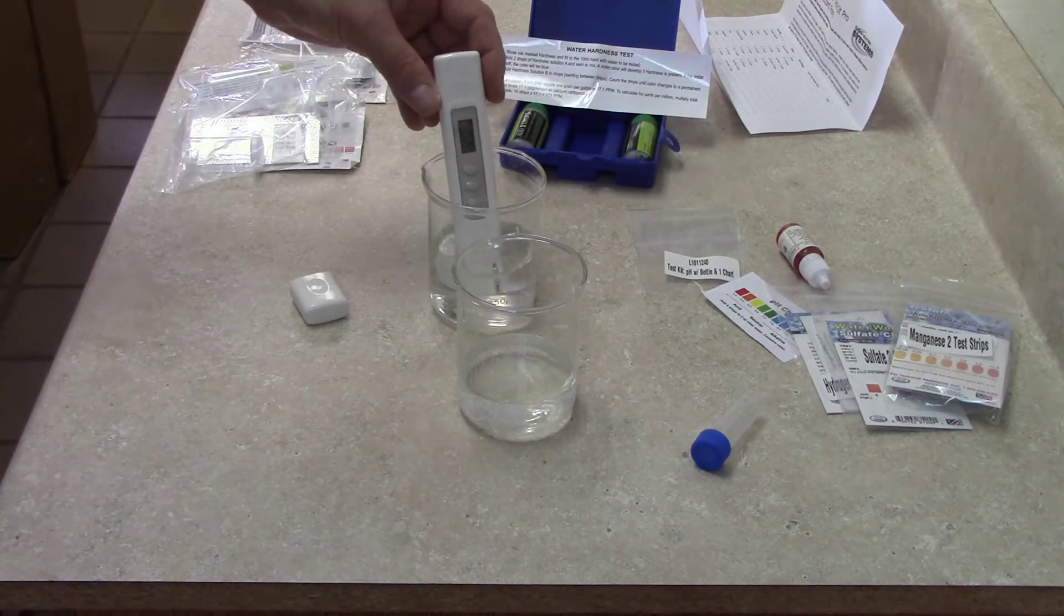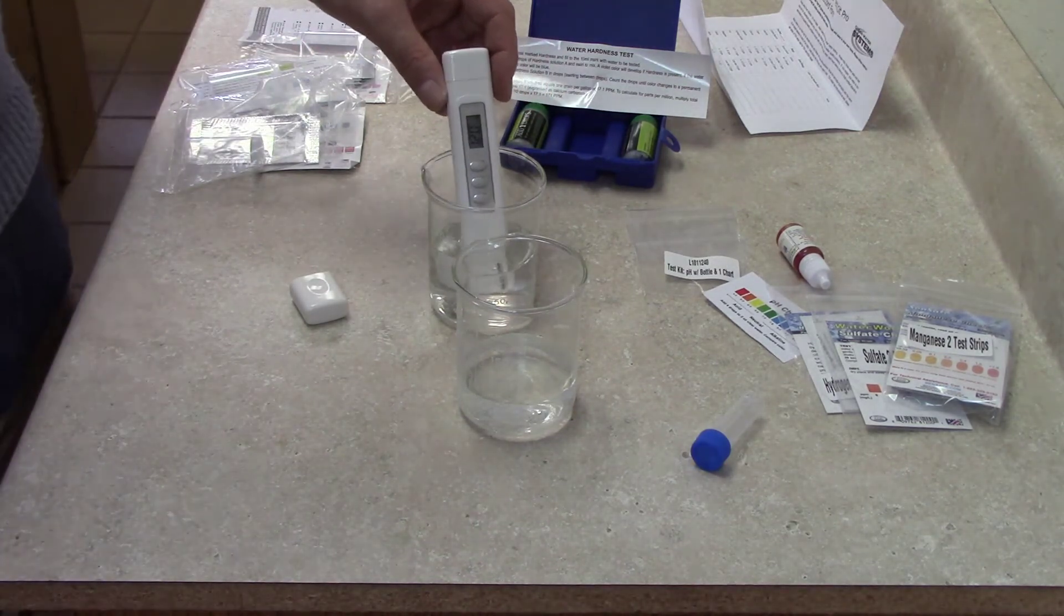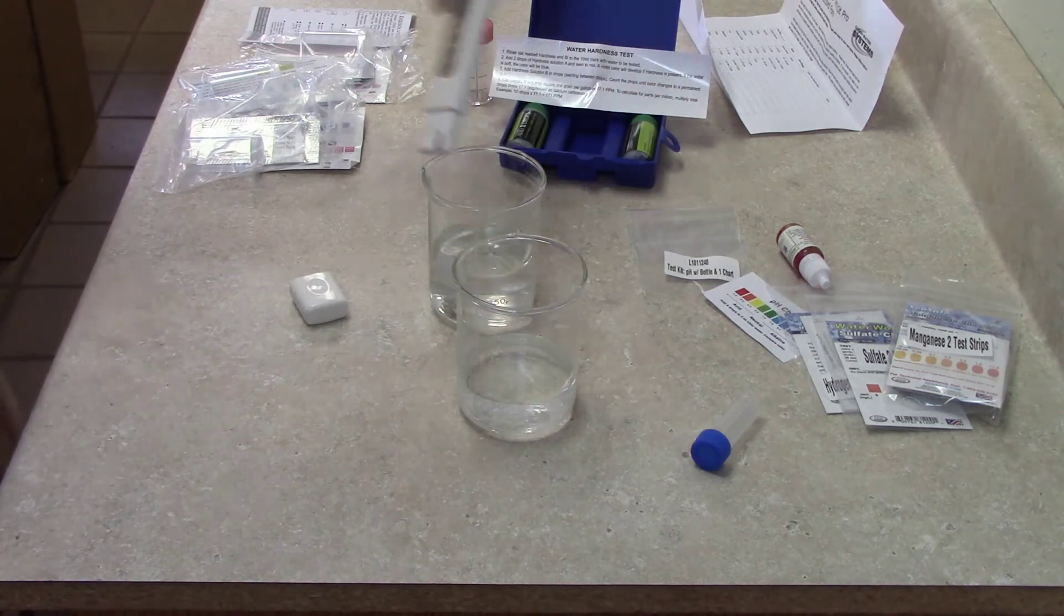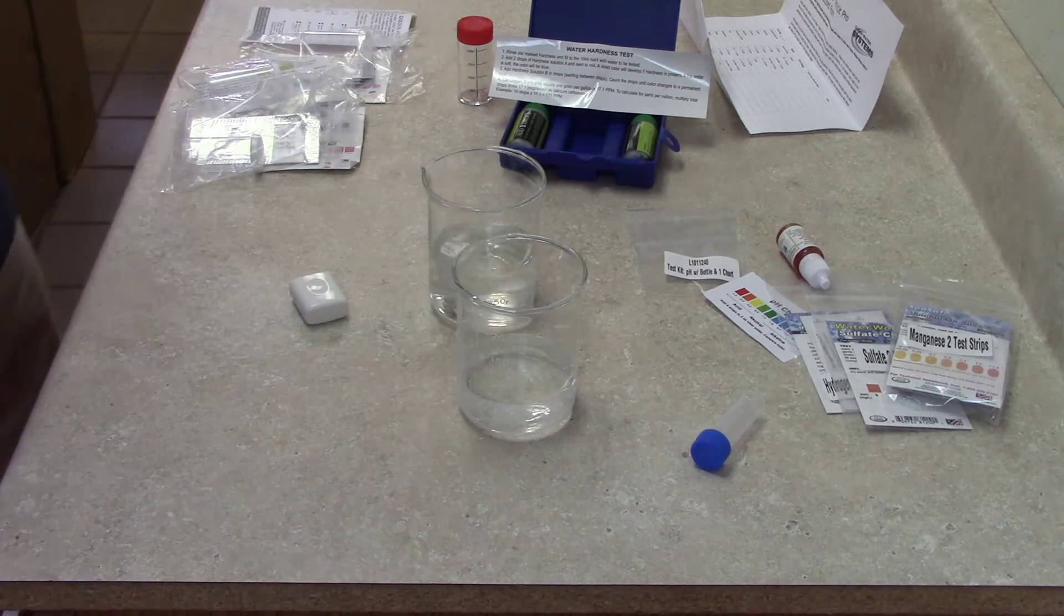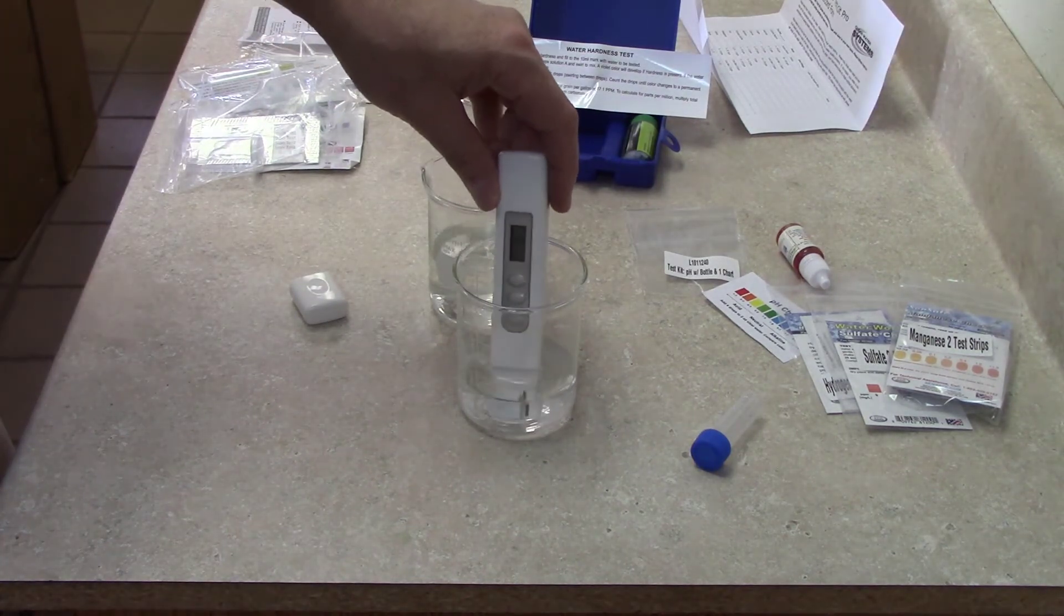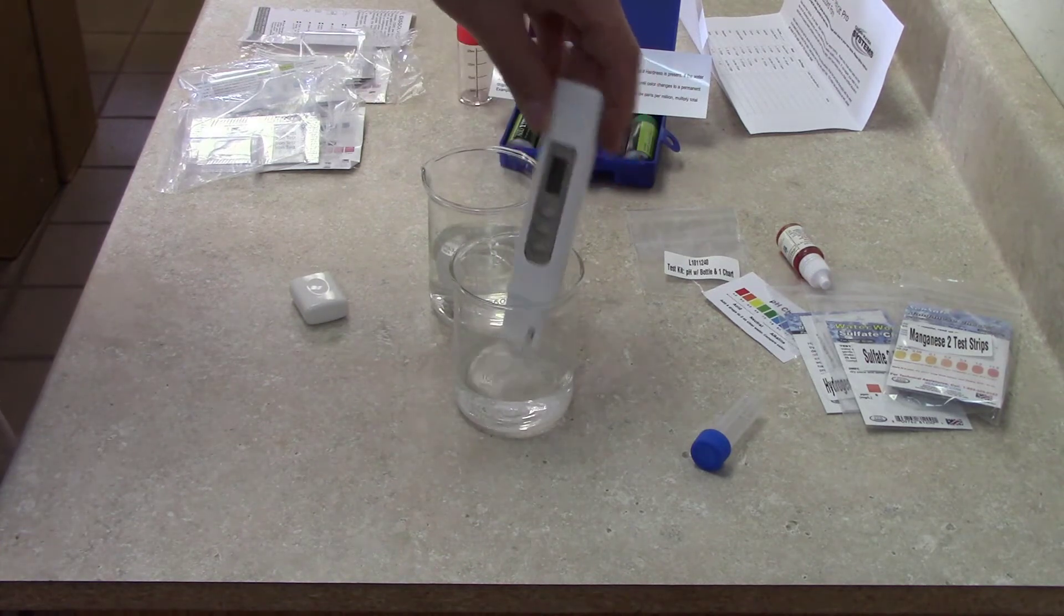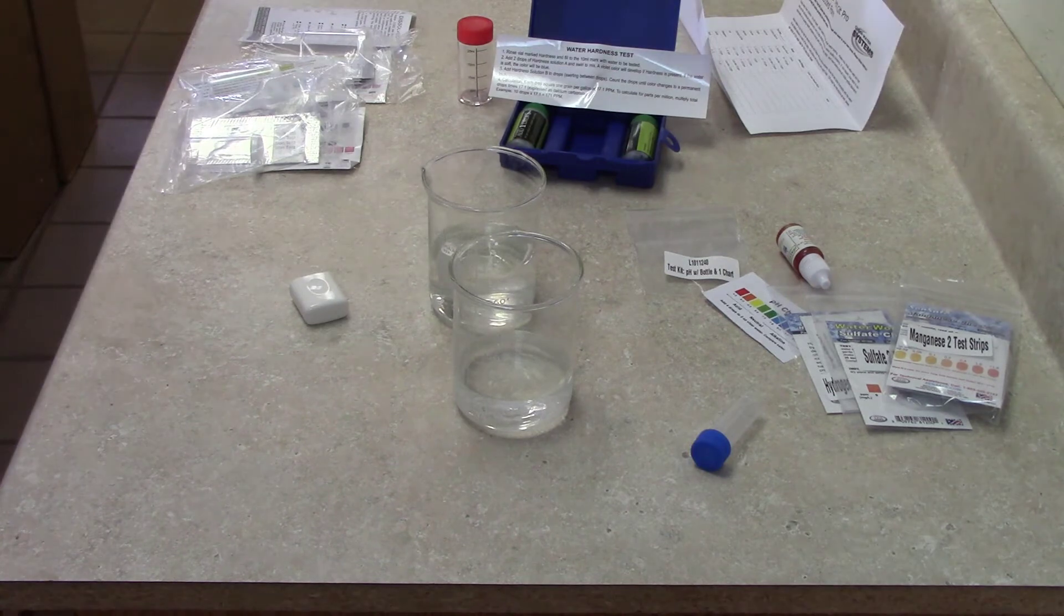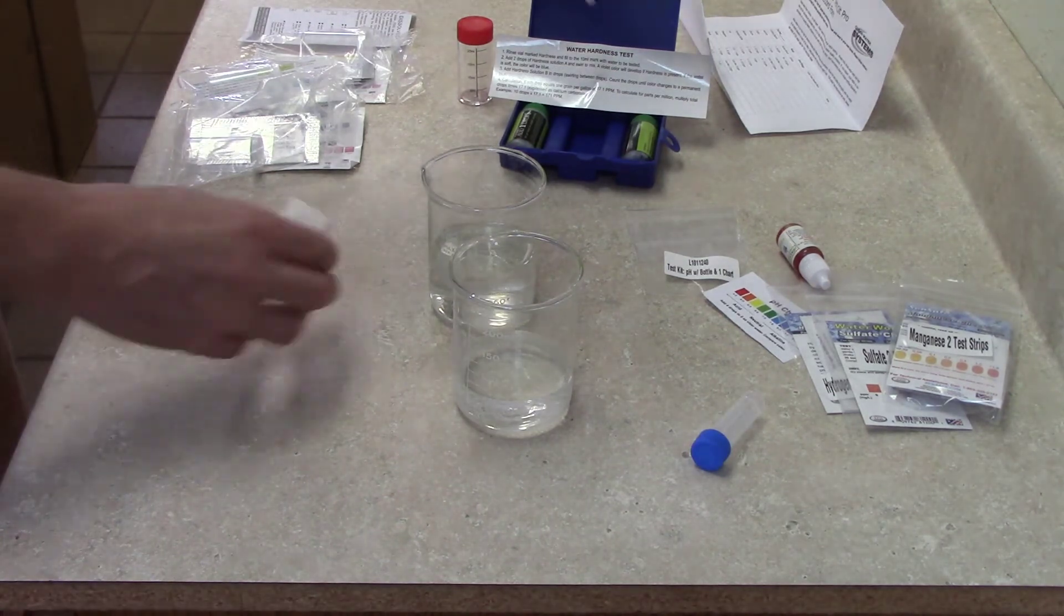For example, my city water here is sitting at 120 parts per million on total dissolved solids. Then I'll stick it in my RO, reverse osmosis water, and it drops down to about six or seven parts per million. So it tells you that the thing is working if you sample it on two different waters. That's basically how that works.